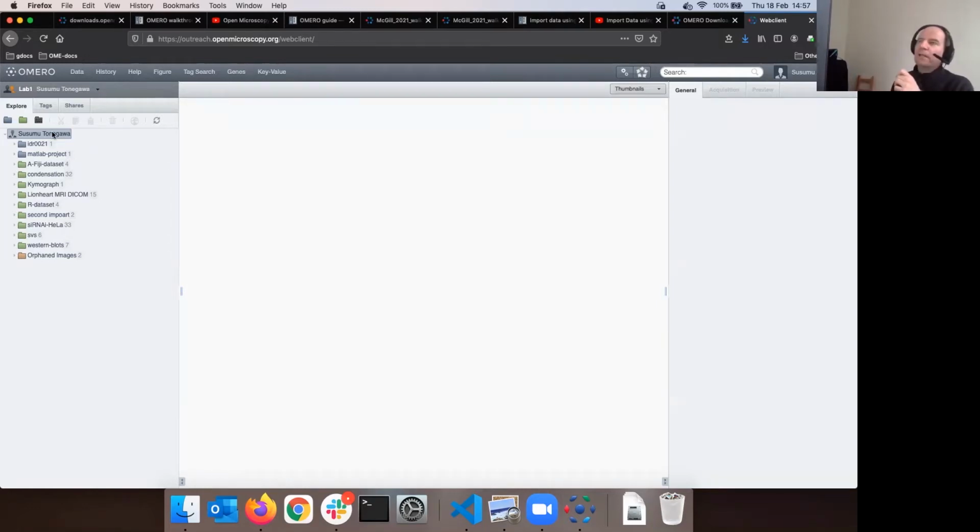And in the training situation, we have another case here. We simply have the username, the login name, a little bit less logical from the normal world perspective. It's not S. Tonegawa, because we would never get our head around that when we are distributing those names. Okay, that's why it's user 49.